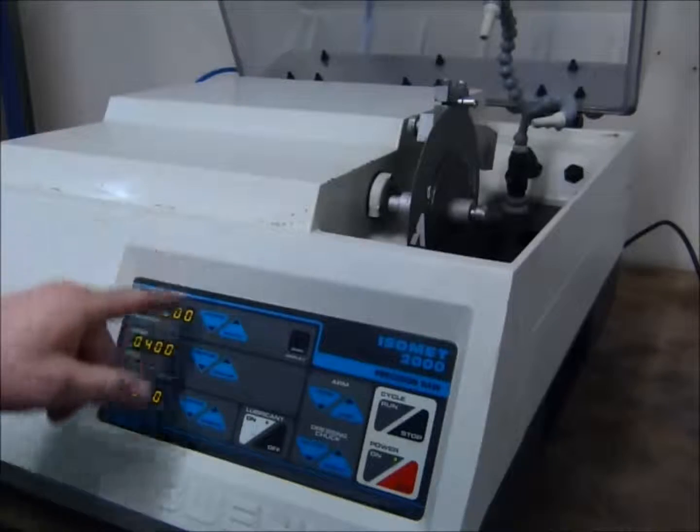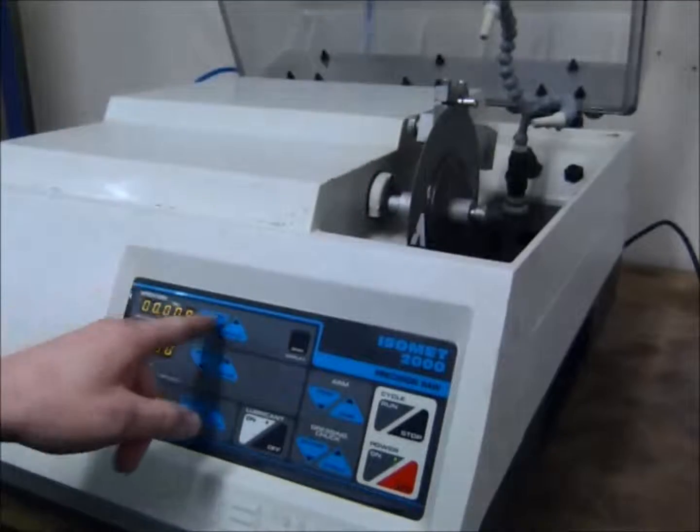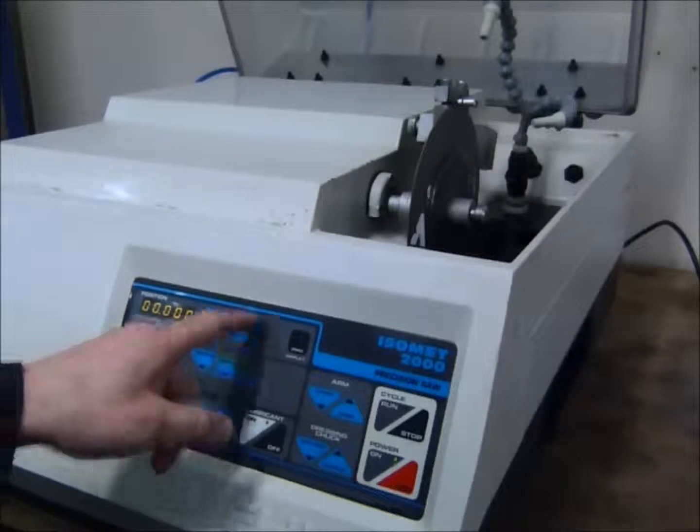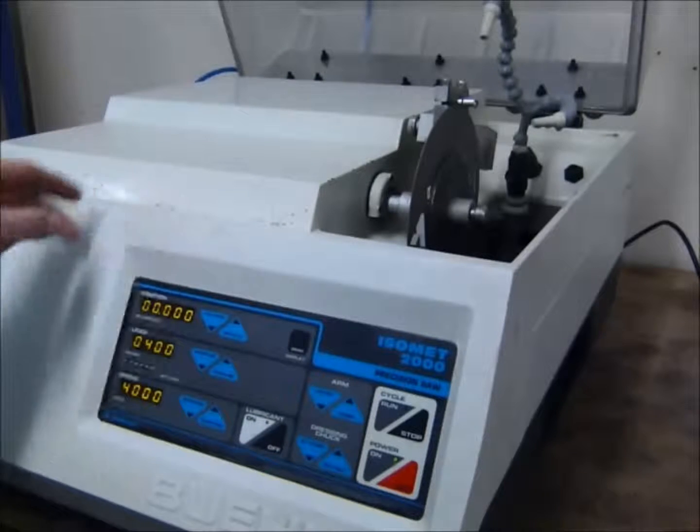You can also set the position where you want to cut, advancing and retracting the arm, positioning your sample where you'd like to cut it.